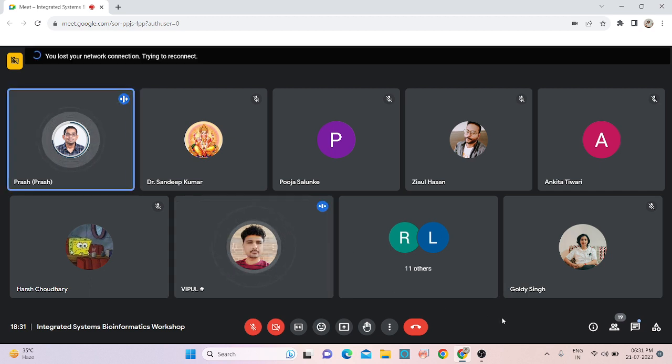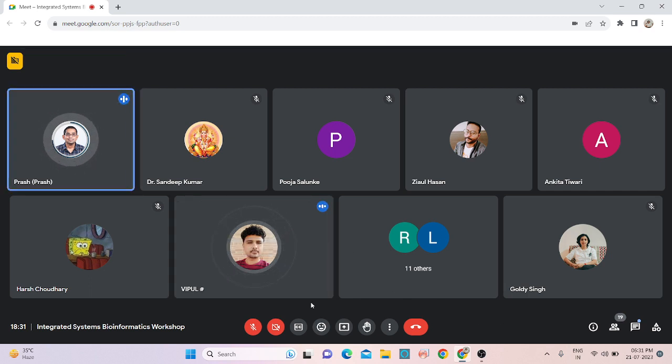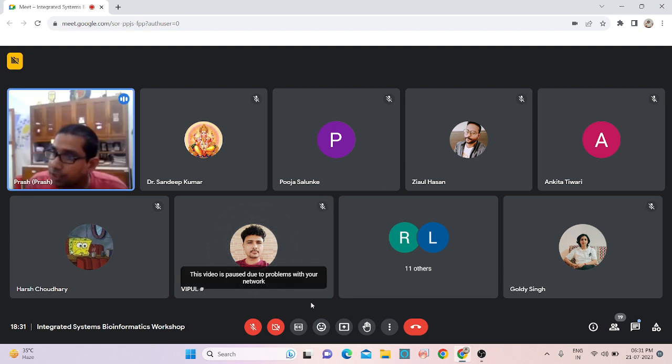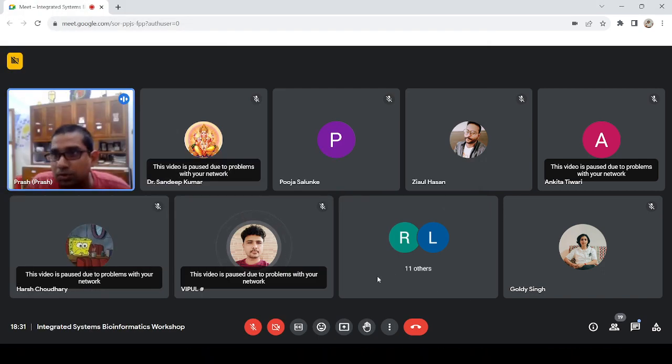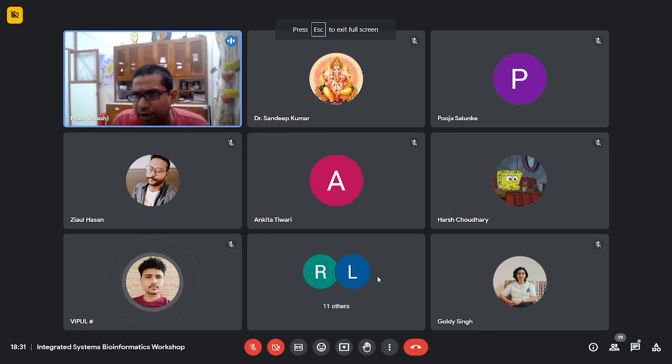Instead. But if they are replicates, you can merge them. You can merge using Cuffmerge. But if they're individual, proportionate, then you can run Cuffquant. Cuffquant also comes in a similar way. So it is like this. You run Cuffquant like this. So you see it's the same thing. You can quantify those replicate SAMs across each condition. So you can do this.